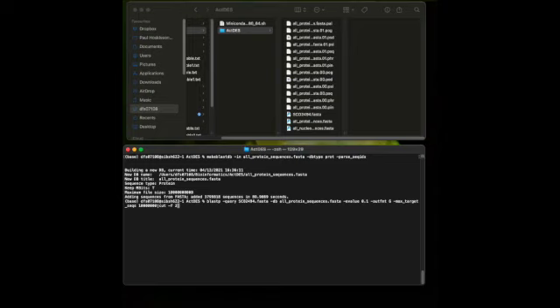And then we'll tell that to create SCO2494, and we'll call that hits. Okay, missed a space out there, and then we'll just call this a .text file.